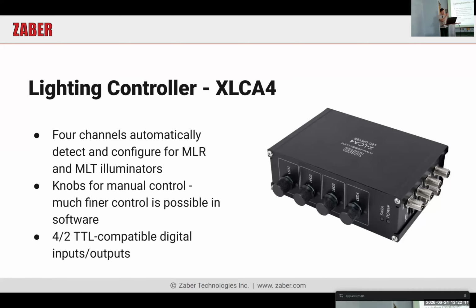Lighting controller does what it says on the tin. These also have a bank of TTL IO on the other side, so that makes it handy for controlling and syncing third-party hardware and equipment.